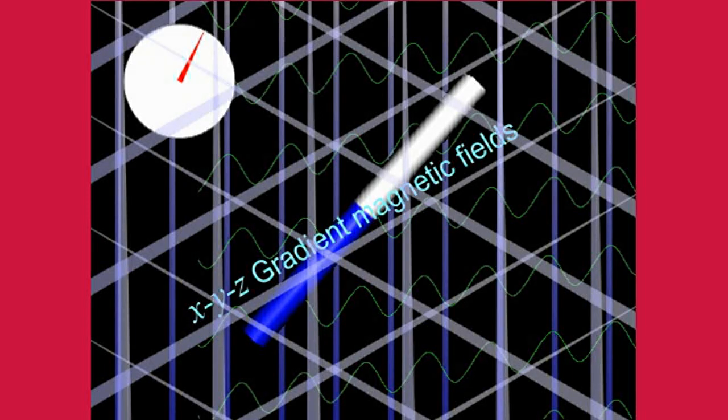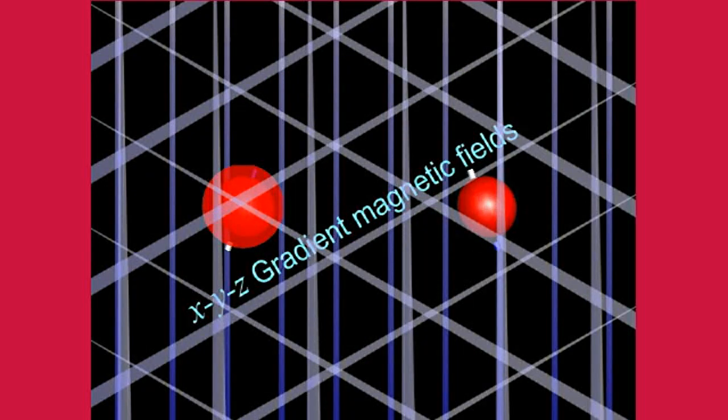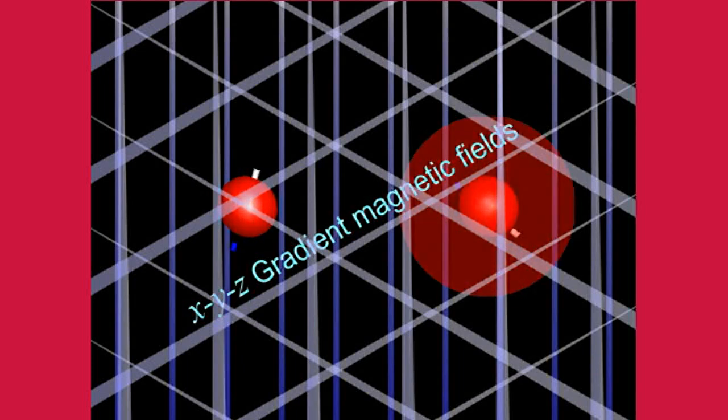Here, the time it takes for the magnetization strength, which has the same direction as the static magnetic field, to recover to 63.2% of the original strength is called the spin lattice relaxation time. In order for an atomic nucleus once excited by external energy to return to its original state, it is necessary to release its energy to surrounding molecules and atoms. This energy is emitted in the form of electromagnetic waves, and the total energy of the atomic nuclei is attenuated.